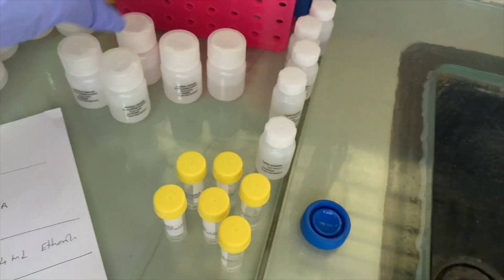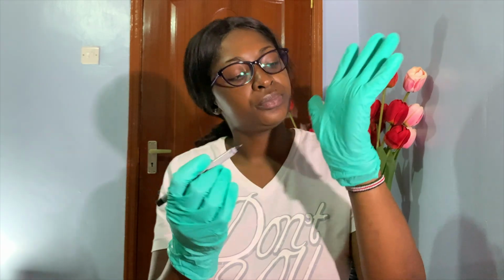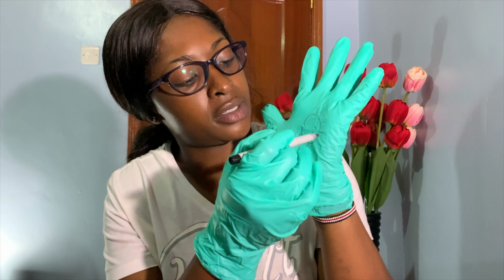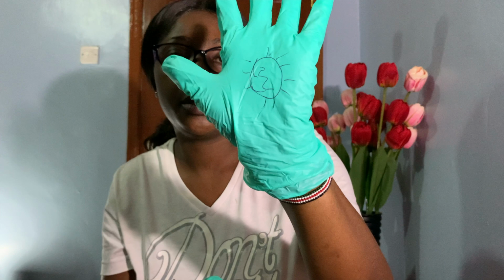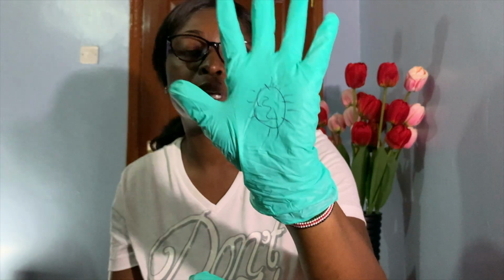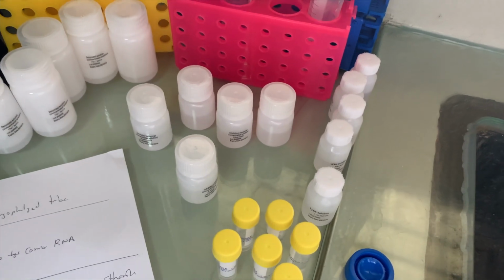The lysis buffer is basically going to break the cell. You know, like the human body, we have cells. Say this is the virus cell. Inside we have the RNA. For us to get into the RNA, we need to break this cell so that the RNA will be exposed. That's why we use the proteinase K and the lysis buffer, so that the RNA is exposed, still in the fluid.